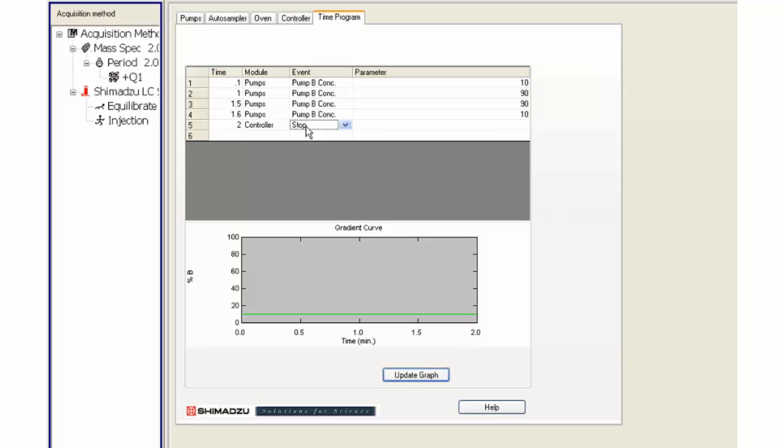Change the module cell to controller. Select stop in the event column. Press the update graph button to see what the gradient looks like pictorially.